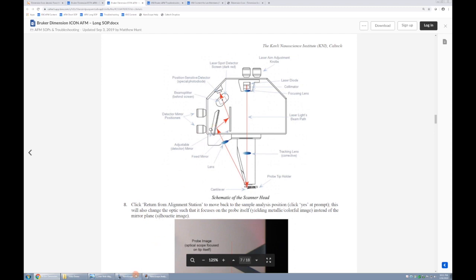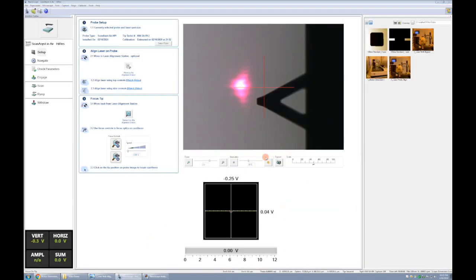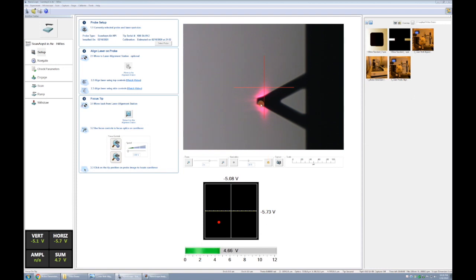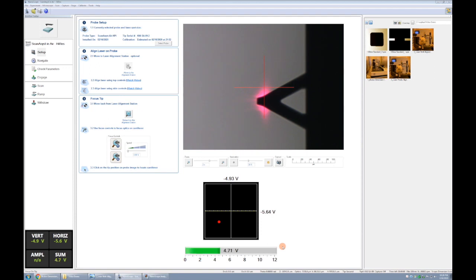Okay, so we'll go back into nanoscope. Now I will grab the top two knobs, and you can see this one moves the laser horizontally, this one moves it vertically. So I'll first steer it to the end of the cantilever where I think that the tip is. It's usually right at the end there. And once I have it there, we are going to then move it again in the X and Y to maximize this sum signal. So I'll move it in the Y and maximize. See, maybe the best I can do is about 4.7. And then move it left and right. And maybe the best I can do is about 4.78 or 79 something like that.